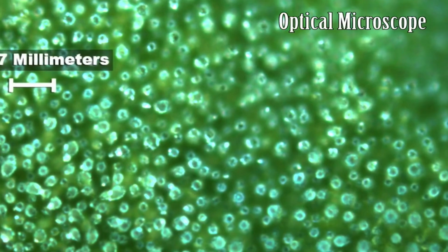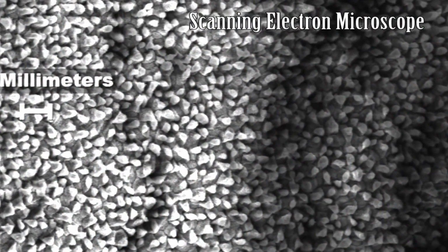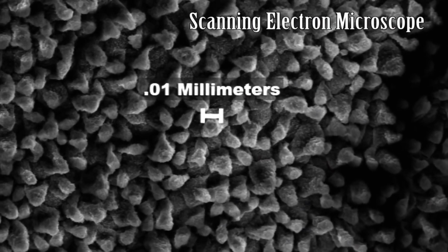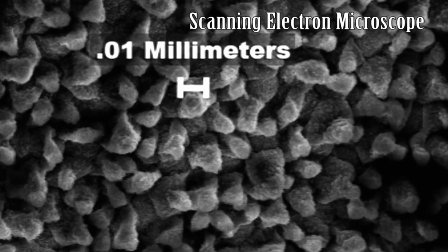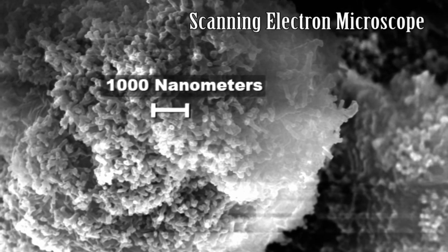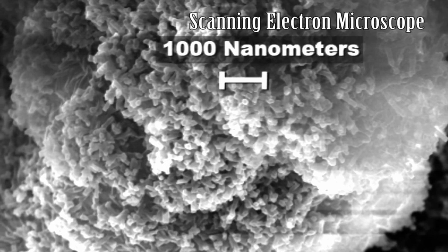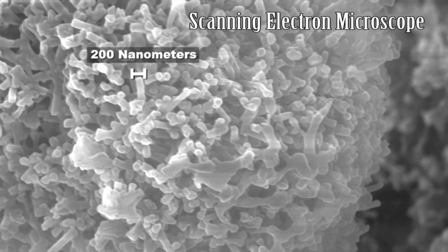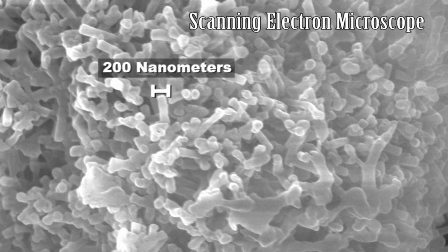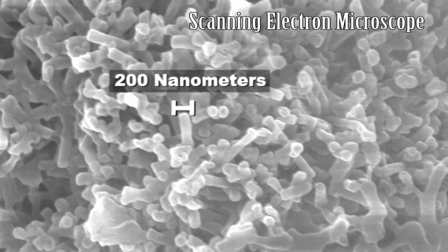And we just talked about how fine it is. It's very fine. And they create a field of many, many hairs of this size and the air in between, which doesn't allow the surface energy of the water to contact with it. So the water prefers to stay in a bubble with itself rather than contact with the surface and make the surface wet. And the attraction between the water molecules is greater than the attraction between the water and the surface. So the water stays away. There are thousands of nano-size hairs on top of those bumps.